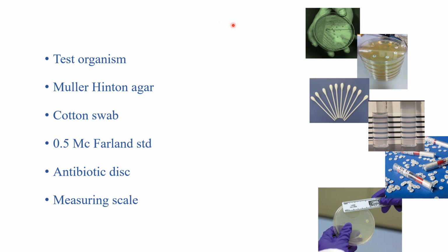For this disk diffusion method, we need a test organism, Mueller-Hinton agar, cotton swab, 0.5 McFarland standard, antibiotic disk, and measuring scale.